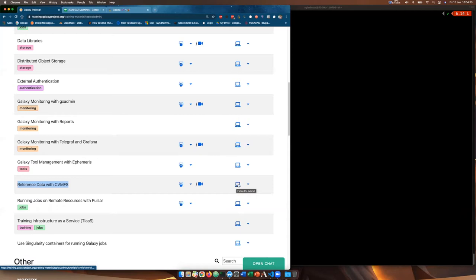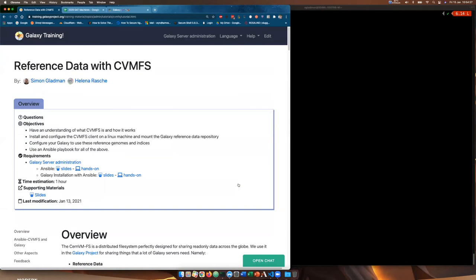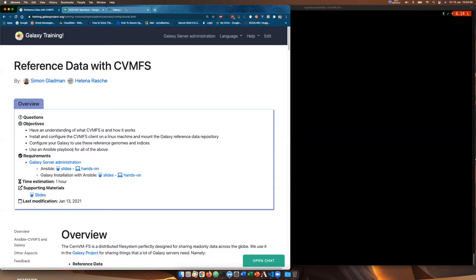In the hands-on tutorial we will be installing it onto our Galaxy servers that we've already created. Some of the objectives of this tutorial are to have an understanding of what CVMFS is and how it works. You will be able to understand how to install and configure the CVMFS client on a Linux machine and mount the Galaxy reference data repositories. You'll be able to configure your Galaxy to use these reference genomes and indices, and we're going to be using an Ansible playbook for all of the above.